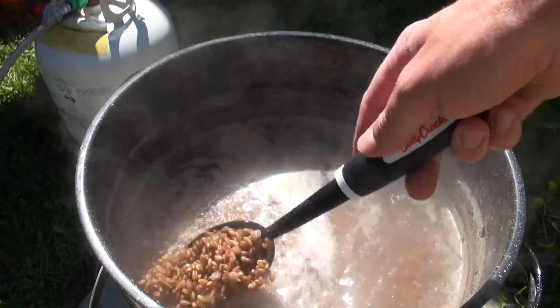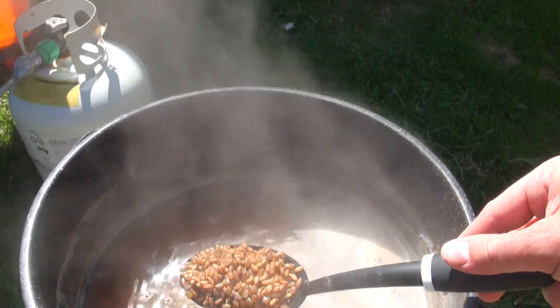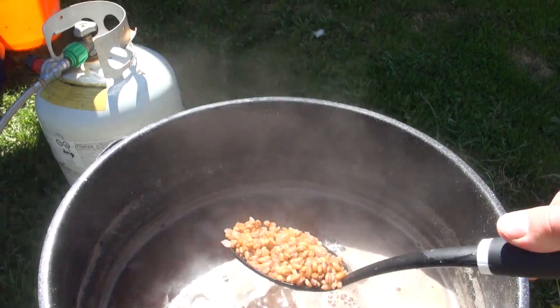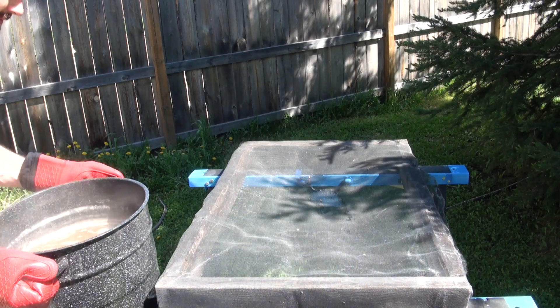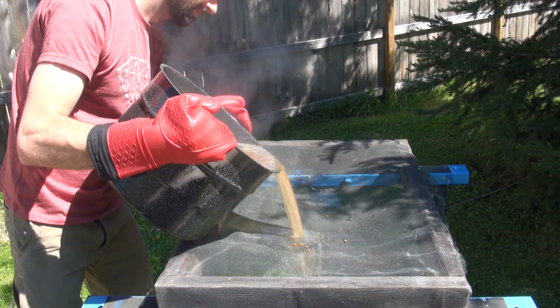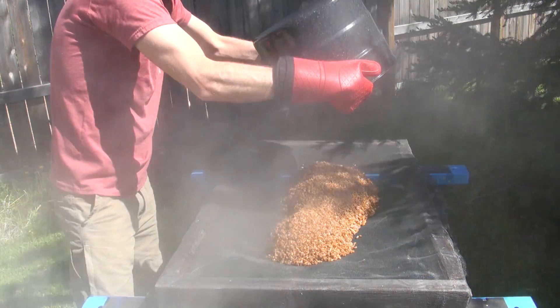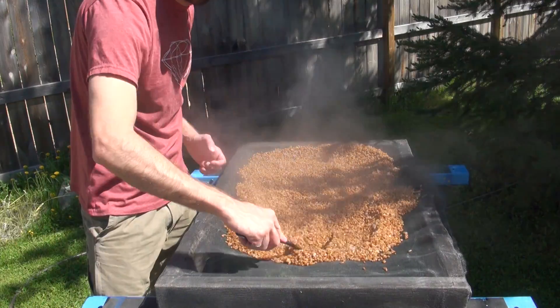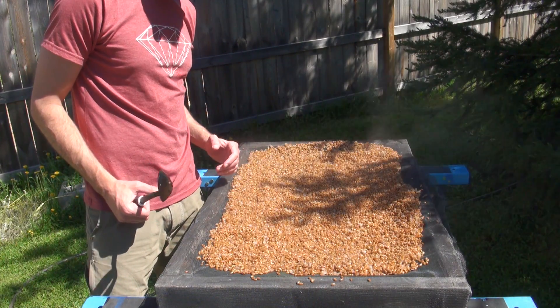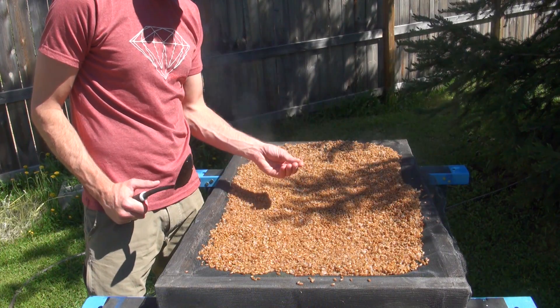The grain has been simmering for about 15 minutes and as you can see, the grain has puffed up quite a bit. There are a few broken grains in there, which is expected, but you want to try and minimize the amount of broken grains. At this point the grain is ready to drain and dry off. You want to leave it like this for about 10 to 15 minutes, depending on conditions, until the outside of the grain is completely dry.